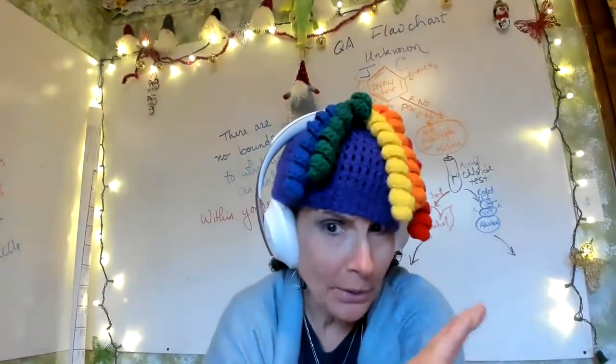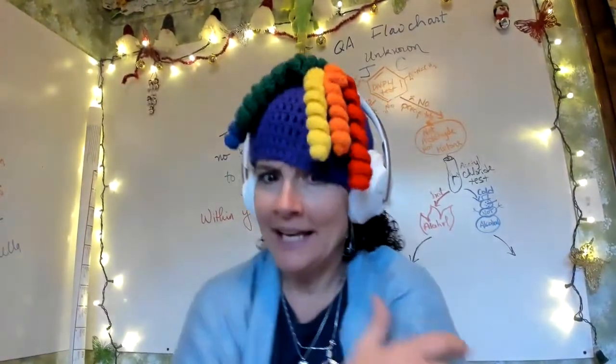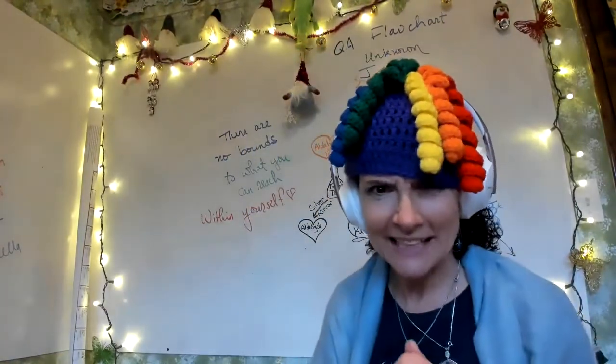All right, I'm here today to talk to you about how to make a flowchart for your QA lab. So this is lab 8. There are some post-lab questions that you're going to answer, but the bulk of the lab is you're going to make a flowchart for the lab. That video was all spliced together, but that's all right, you have the idea.